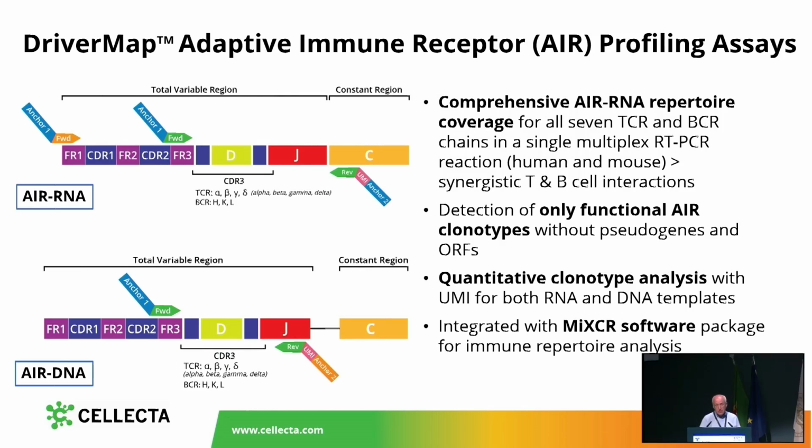We do extension from reverse primers, from forward primers, and after that use universal amplification, using anchor primers from both sides, to amplify a short region between, for example, 100 base pairs to maybe 600 base pairs for full length profiling of the immune receptor repertoire.